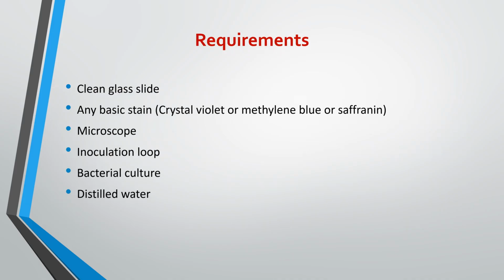Then coming to the requirements. We need a clean glass slide and any type of basic stain, like crystal violet, methylene blue or safranin. We need a microscope, an inoculation loop, a bacterial culture and some distilled water.